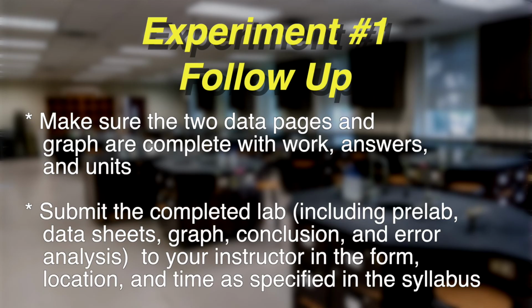Densities of pure DI water and pure 2-propanol. Density and mass percent water of solution 1. Density and mass percent water of solution 2. Unknown number, density, and mass percent water of the unknown solution. Unknown number, density, and ID of the unknown solid.